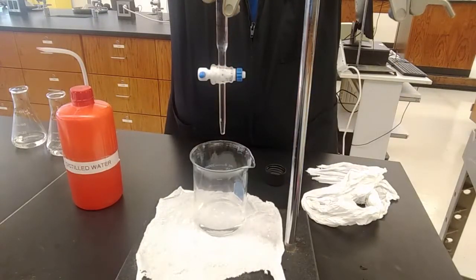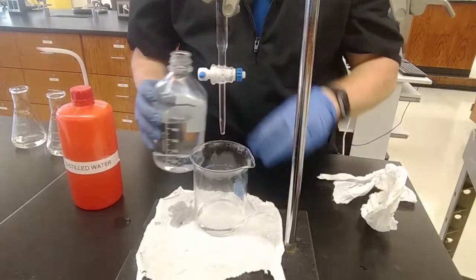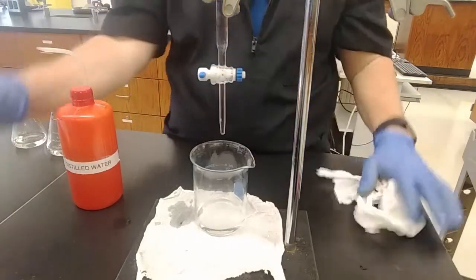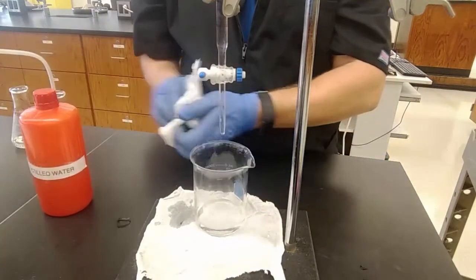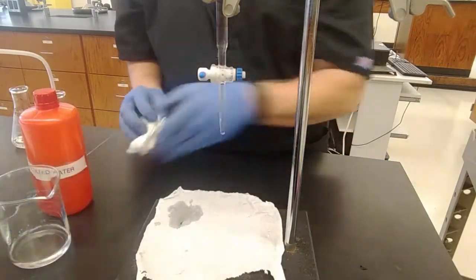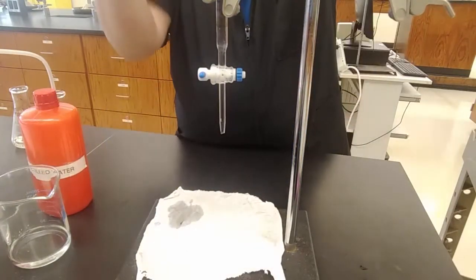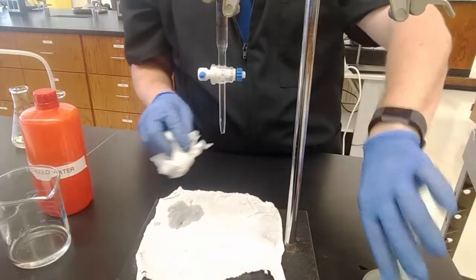So, I add another whatever number of milliliters. See, it's good I didn't have that flask under there. I had a drip. Okay, and another one. So here we go. I need my initial value as I'm starting here. So, I don't have to worry about my tip. It's still good from last time. Taking out my funnel, as always.